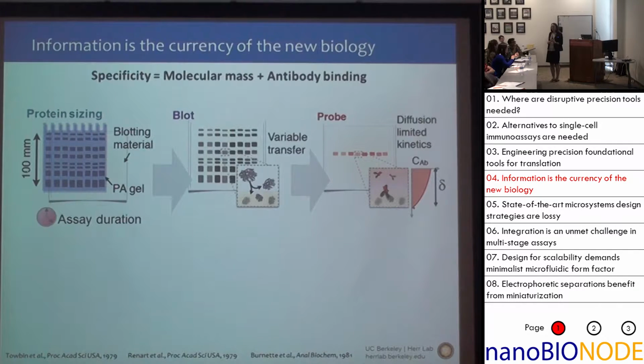That assay can take anywhere between 5 hours and 25 hours to complete, right? And then when you get the assay readout, oftentimes it's not even quantitative, right? It just looks like a little bit brighter band or darker band. And then if you have some sort of failure with your assay, you have to start all over again.